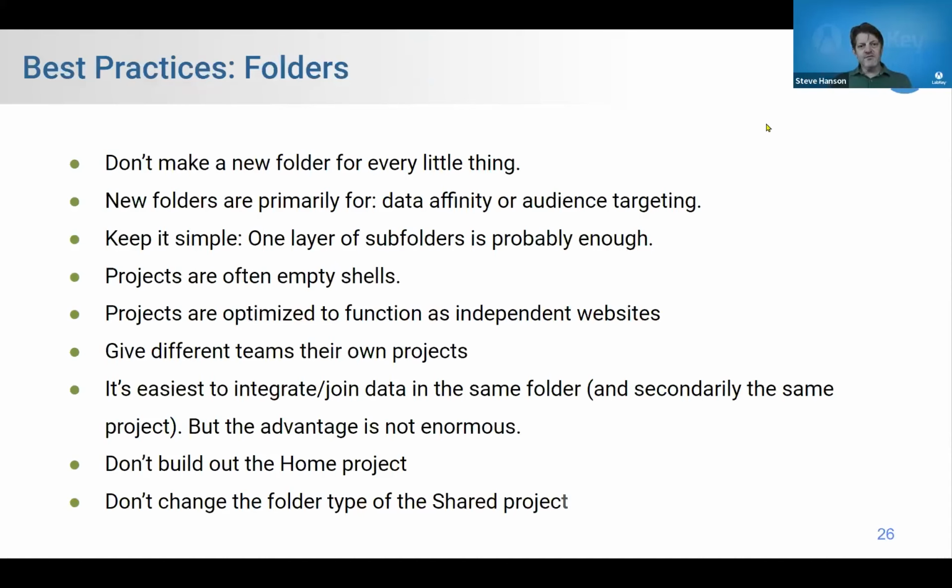A couple of best practices around folders. Like you're a new admin. How do you structure the folders on a site? Well, I think the first thing to be aware of is don't make a folder for every little thing. I think this is a really common mistake for new folks. They think every table needs a new folder. And I don't really think that's necessarily correct. I think you should think about folders as basically independent websites and as things that are sort of revealed or hidden as a whole.